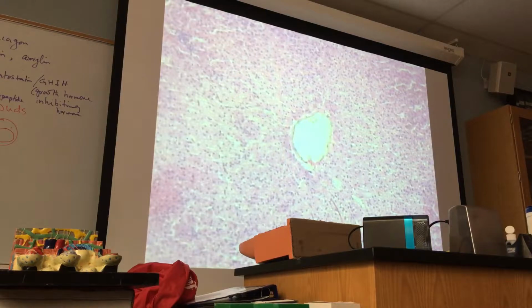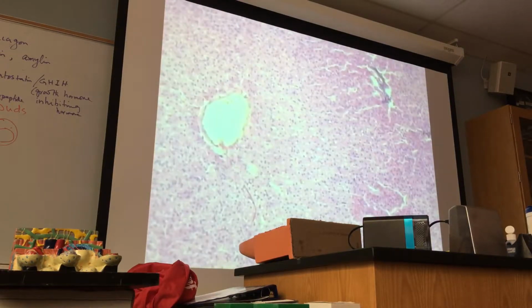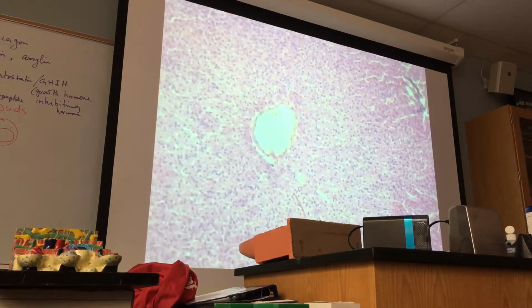Beautiful, beautiful. Look. These are hepatocytes. This is central vein.